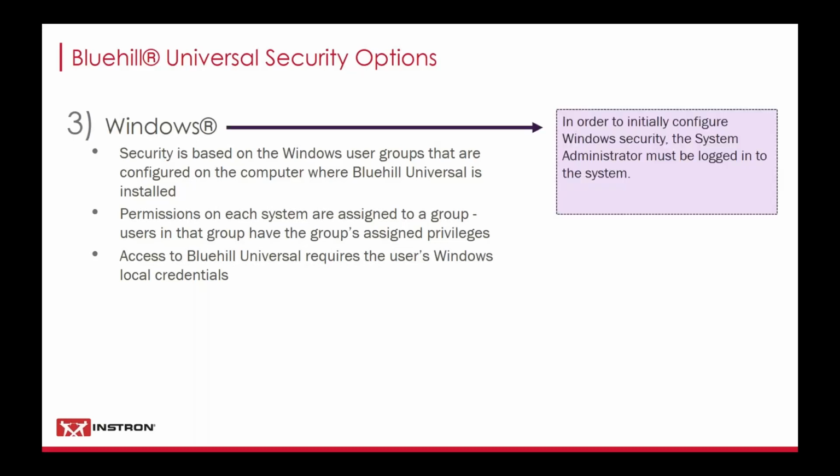So I think this one's pretty straightforward. You would log into your computer using your Windows login. You would also use that same login to access Bluehill. In order to initially configure Windows-based security, the system administrator must be logged into the system.